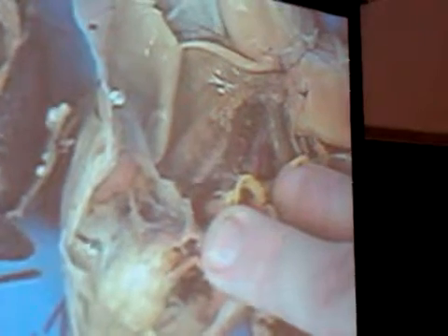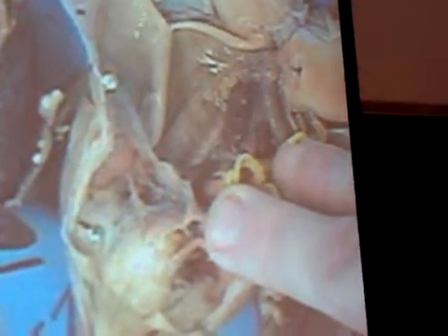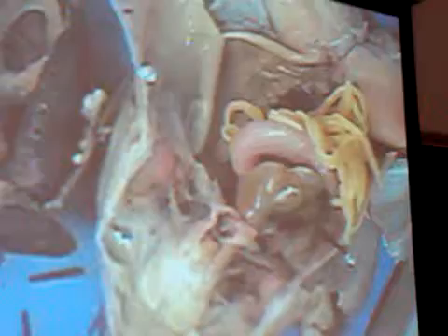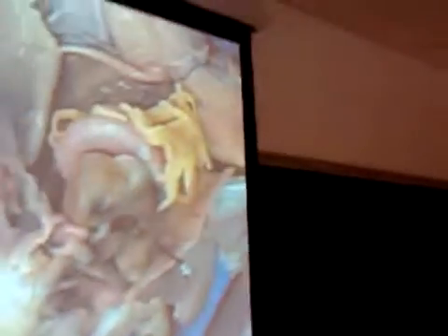Who's got the frog dissection in front of them? The Xerox. Do you have it? It says general, not urogenital. Well, yeah, it's that. What does it say about leopard frogs? You can stop right now. Yeah, stop for a second.